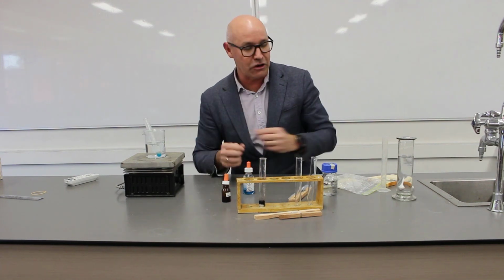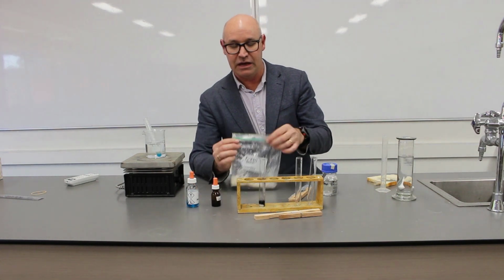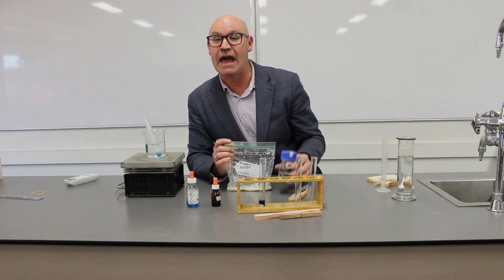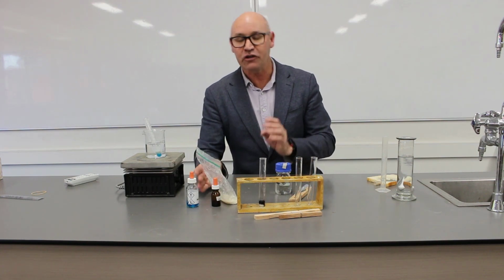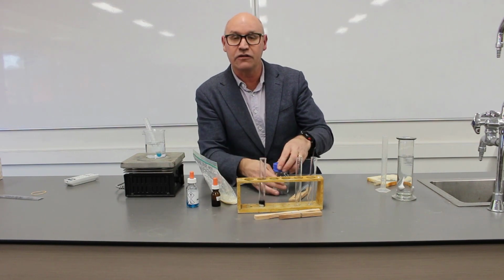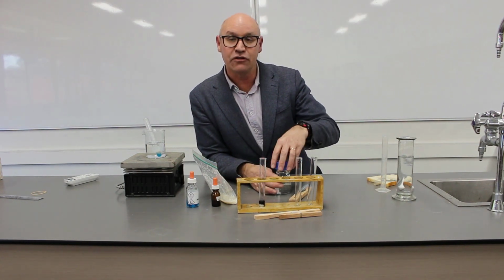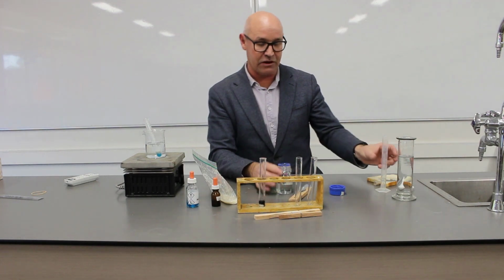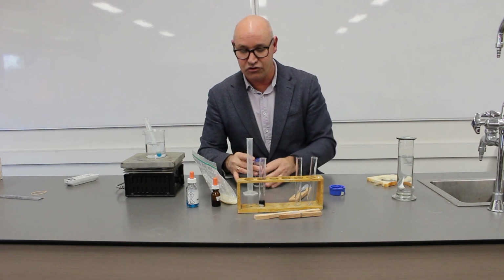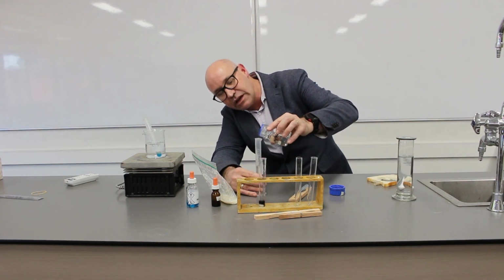While that's going along, we're going to do the next part of digestion, and that is chemical digestion. That occurs with enzymes. Because we're trying to break down starch into glucose, we're going to use the enzyme called amylase. And we're going to use 20 mils of amylase. So this is the amylase here, it's a liquid. I'm going to pour it into our measuring cylinder. Measure that out accurately.